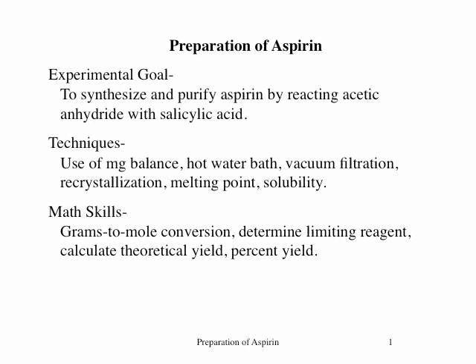Aspirin is a common over-the-counter analgesic that you will synthesize in this experiment. It is prepared 1 week and characterized the next. By allowing it to air dry in your lab drawer between lab periods, you can determine during the second week the reaction's empirical yield and aspirin's solubility and melting point.